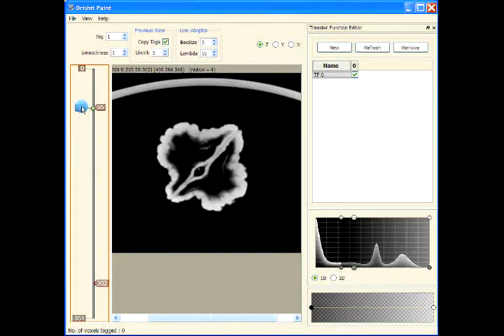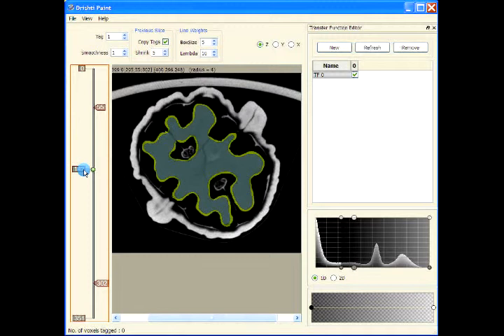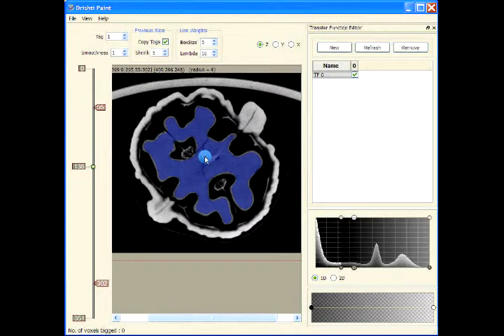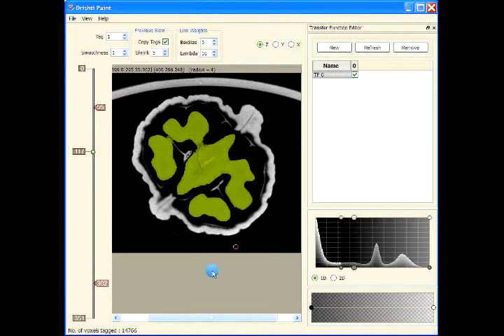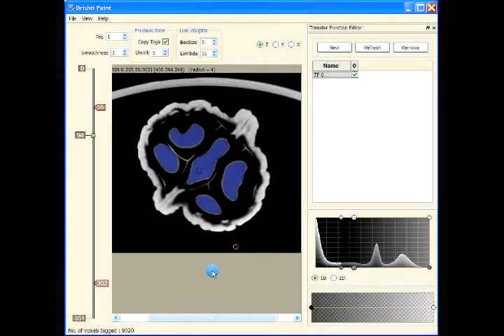maybe a bit below. Okay, and then we can start this tagging operation again from, say, this slice here. So again press Shift T, and now we want to go backwards, so press backwards and OK, and you will have your data tagged.